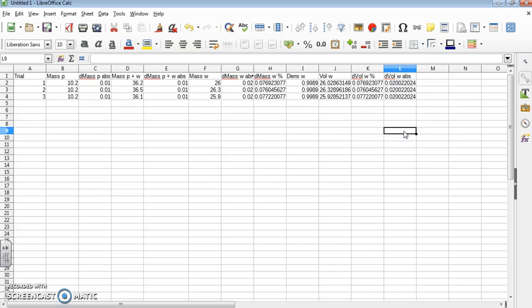So now I have the volume for the 3 trials, and I need to really have an average here. So that was the last step. Hey, what is the average going to be? Because I'm going to eventually need to use that in part 2. So the nice thing here can be an average. So I'm actually going to type the word average. You don't need to do this, but I'm doing that just to sort of keep track of it. Oops, I need to move it over one. Well, now I can move it over one.